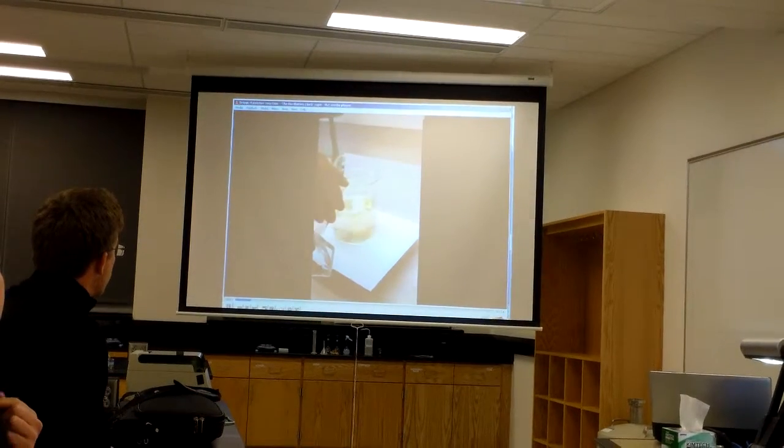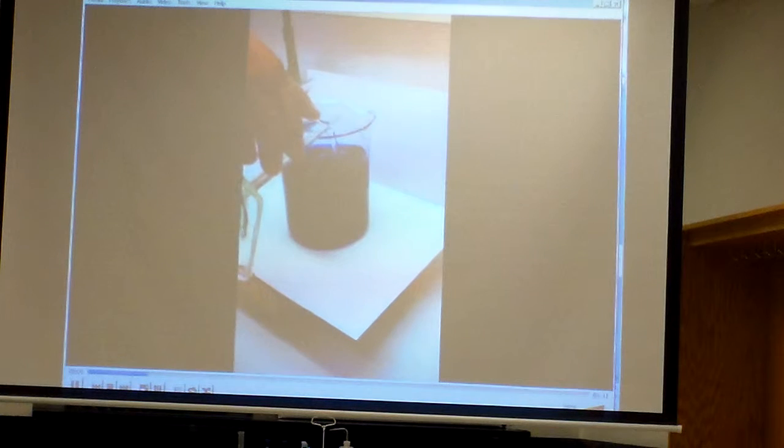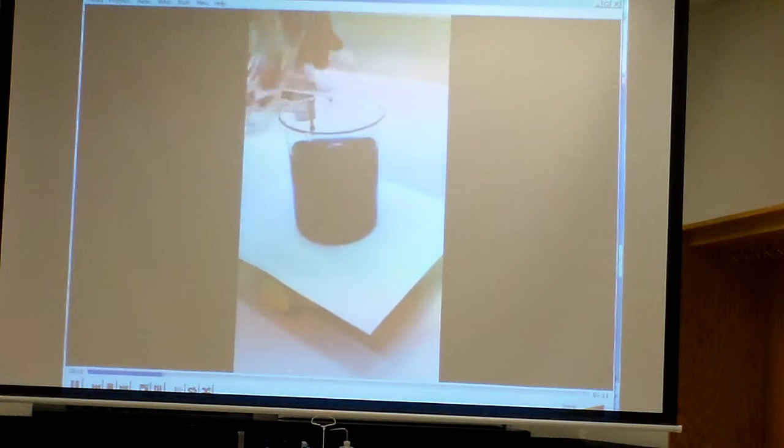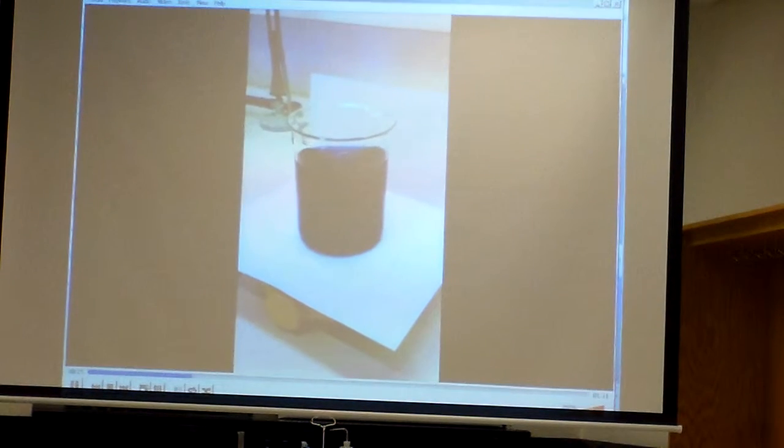Oh, you are students, but if you become teachers one day. So the amber color is iodine, I2, and then switches over to the starch complex. And I'll switch back, and the clear colorless is iodide, the anion. So it just keeps flipping back and forth.